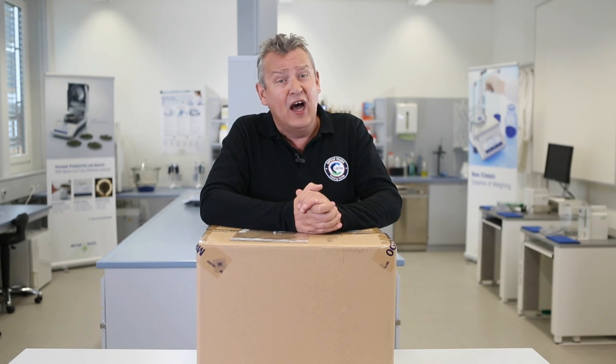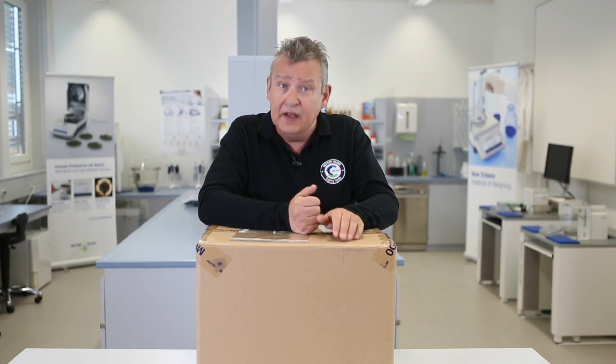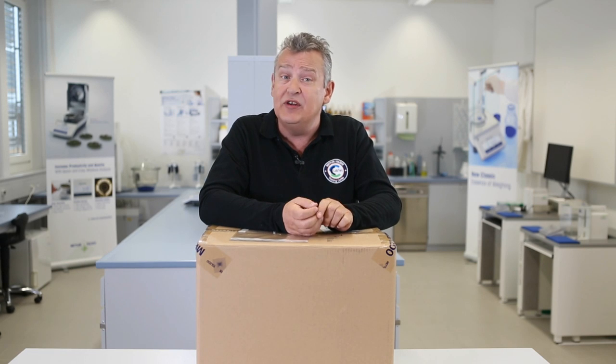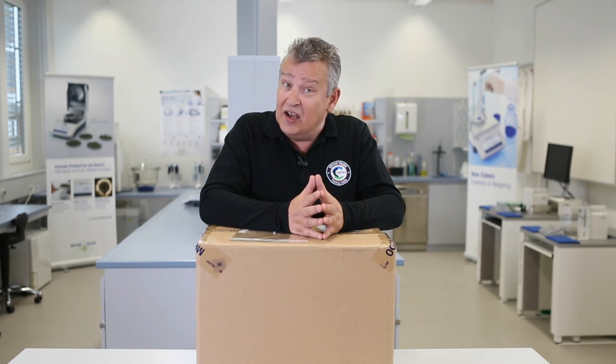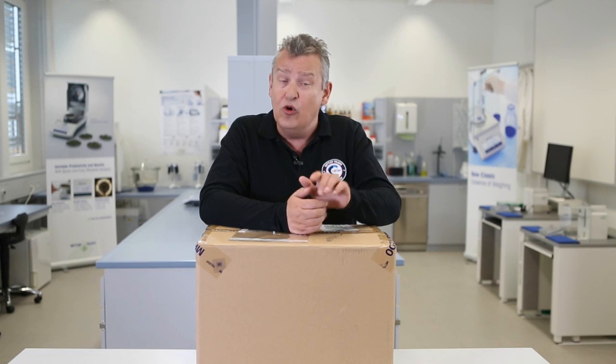Congratulations on your purchase of the HE53 Halogen Moisture Analyzer from Mettler Toledo. To guide you through the unpacking and setting up of your new instrument, and to help you to perform your first measurement, we've put together this short instructional video. After watching this quick start guide, you should be ready to successfully use the HE53 for your moisture determination applications.